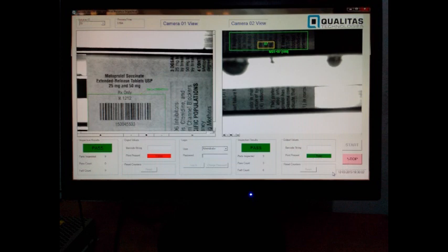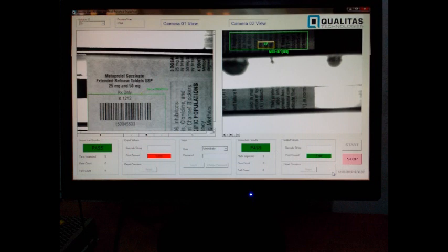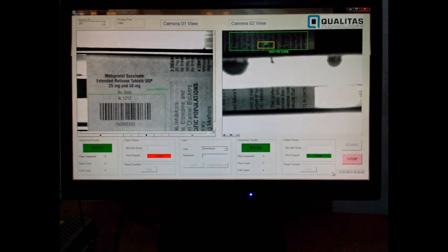A screenshot of the online running dual camera system is shown here. Barcode reading is done on cam 1 output and presence/absence on cam 2 as shown.